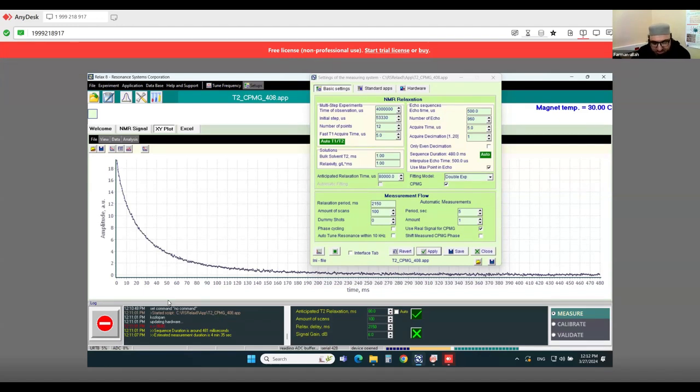You must manage these things, this noise. Further, if you take such a result which is noisy and you plot it in Origin, the plot will not look very good. So to get a result that is not noisy, you must manage it here by changing the amount of scans and the signal gain value.